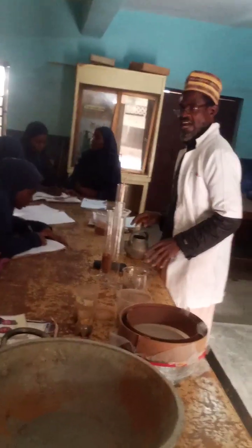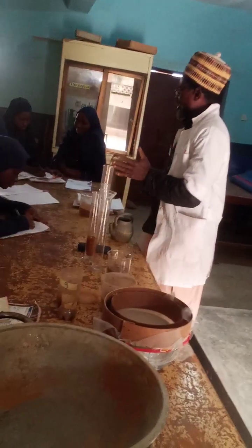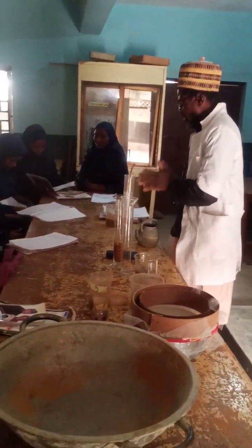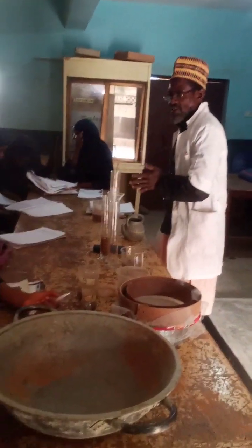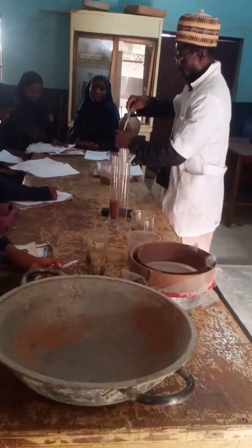The aim of adding hydrogen peroxide is to break any organic matter that might cluster the particles together. Is that clear? So the organic matter will be broken with the addition of hydrogen peroxide.